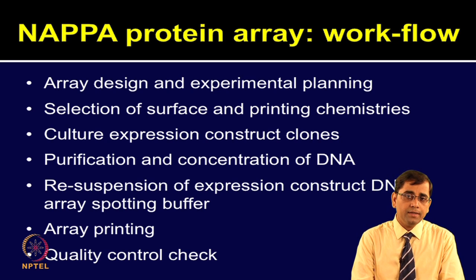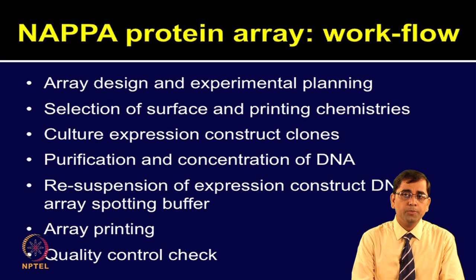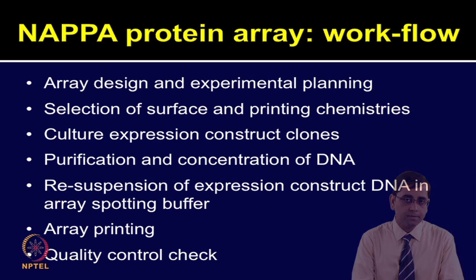If you want to identify biomarkers, for example, if you are looking at serum screening, you need to have some good control spots such as human IgG or mouse IgG. Thus, a lot of thought goes into designing the experiments for microarrays as opposed to what one does in other types of proteomic technologies.